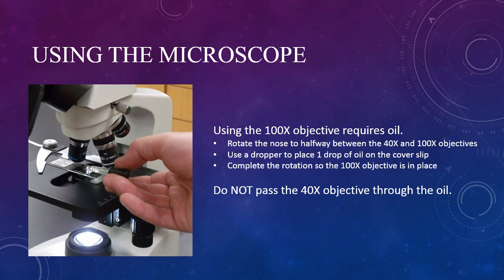Oil redirects that light to the objective lens. We add the oil to our setup by moving the 40x objective away from the slide, but stopping before the 100x is in place. Add just a drop of oil to the cover slip, then complete the rotation with the 100x in place.